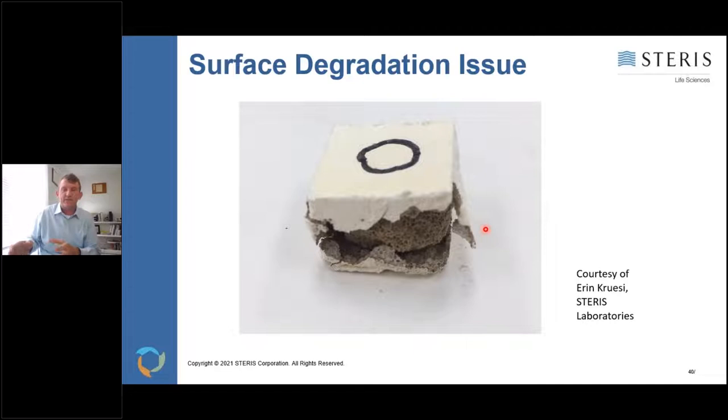And then here's one that shows that some things that are very well intact, maybe in a wall or well intact in a floor, when you do create coupons, they can fall apart. And you can see here that once this coupon here was cut, you lost the integrity of the coupon. You no longer have a true intact surface to test. Instead, it's degraded to the point that it's going to be very hard to use in the study. So surfaces are key. Next slide, Jim.